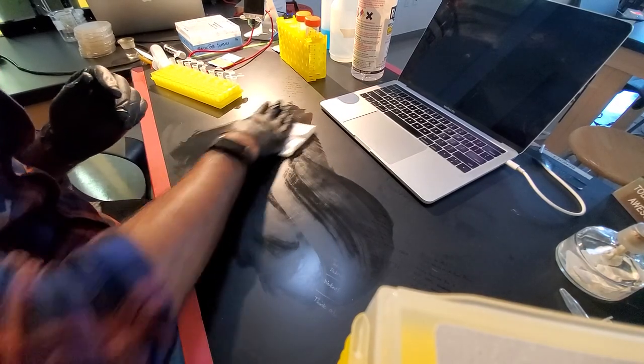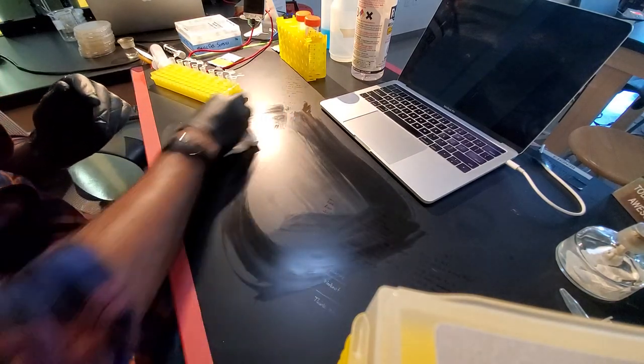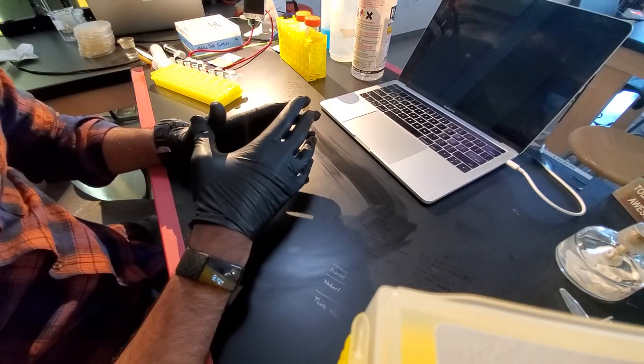When you're filter sterilizing, generally you're trying to sterilize something but you don't want to use an autoclave or heat to do it because autoclave or heat is going to break it down. So you do this a lot when you're using antibiotics.